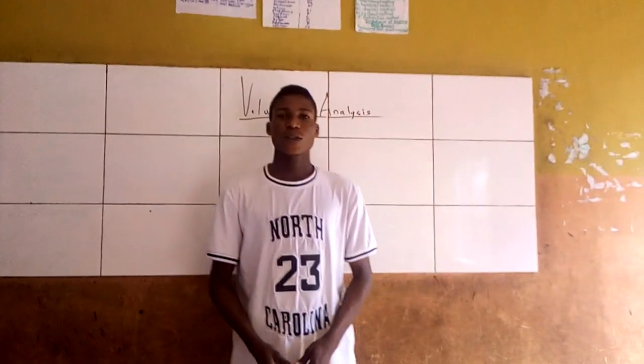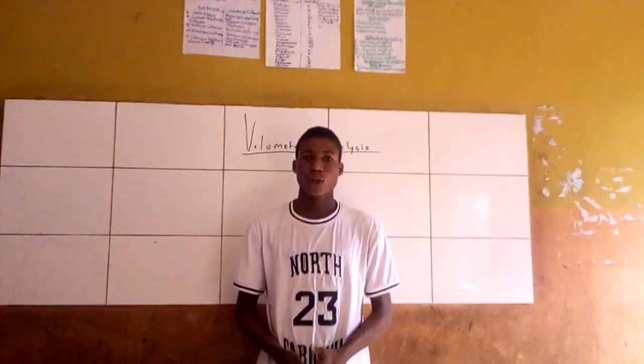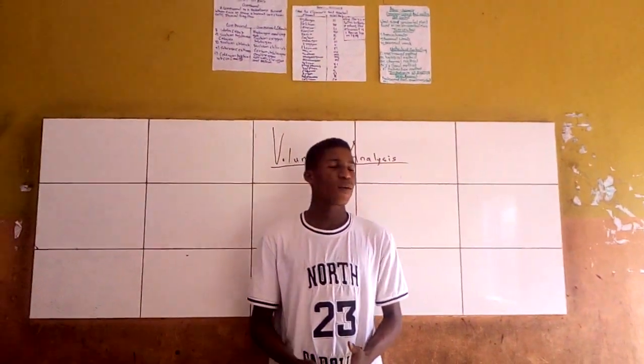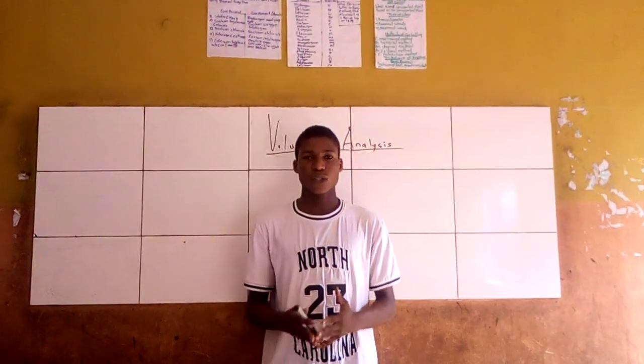Today we'll be talking about volumetric analysis. Volumetric analysis, as the topic says, is the calculation of the volume used in a chemical reaction. In order to carry out a volumetric analysis experiment, you will need the standard solution. The standard solution is a solution of known concentration.